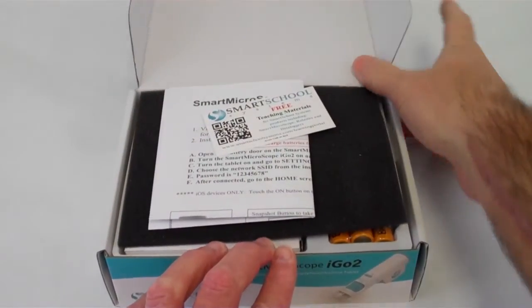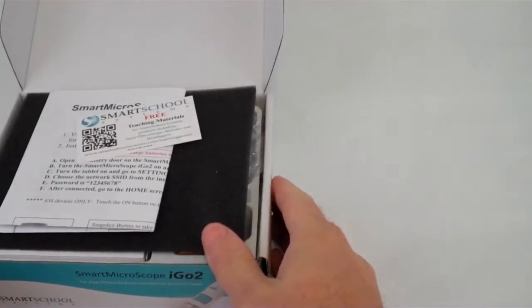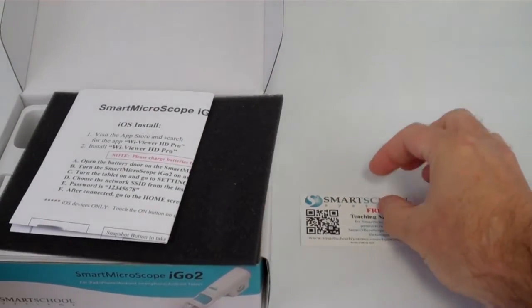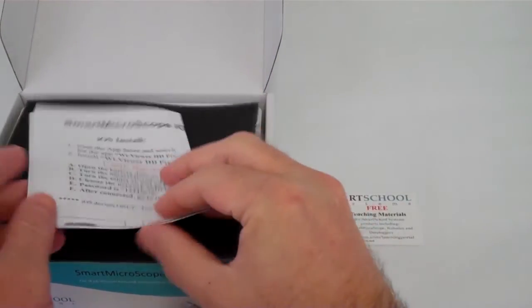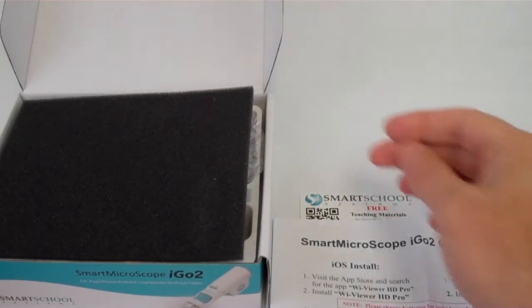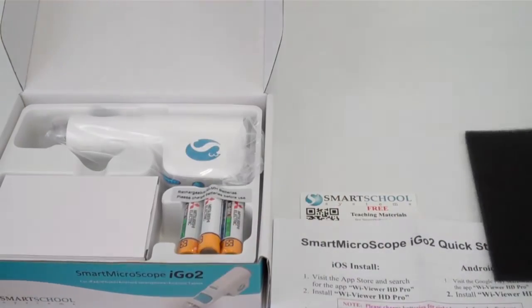You'll see a card that has information about teaching materials. There are investigations for elementary science, middle school science, and biology available in our learning portal. You'll also find a quick start guide for both iOS devices and Android devices.